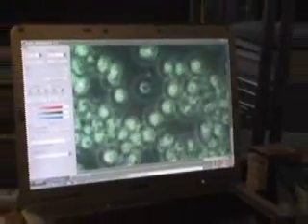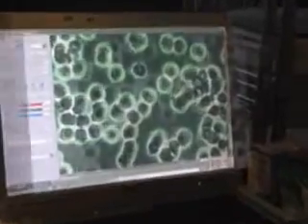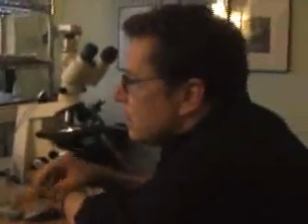Here they come — red blood cells. Look at that! Look at those beauties. Are you drinking any plain water? No, just lemonade. Look at that — all dehydrated. So those are the red blood cells with a nice healthy little reflective lipid coating on them.